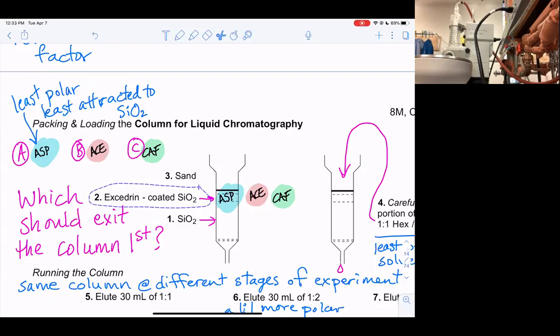So I have a water bath, like 40 C or so. I'm gonna turn the rotation on the rotovap. So that's the rotary part. If it's not rotating, then whenever it boils, it won't boil evenly and it'll just shoot up. That's never fun. So inside the water bath, I'm gonna rotate it a little bit.